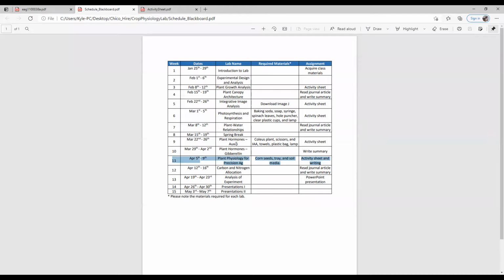I expect those will look pretty good. It's kind of a fun project. We didn't have all the necessary materials, as you probably found. It would have been good to have a source of carbohydrates in there with that auxin. But I think we had a pretty good coverage of that. And it looks like some of you all have done a good job of getting those in and doing a really nice job on that.